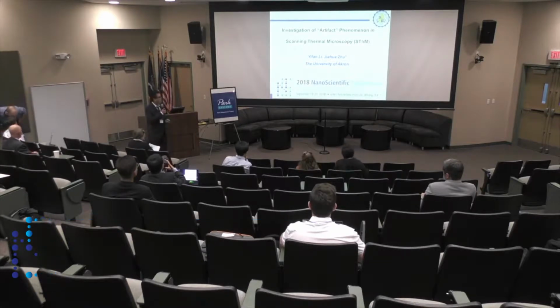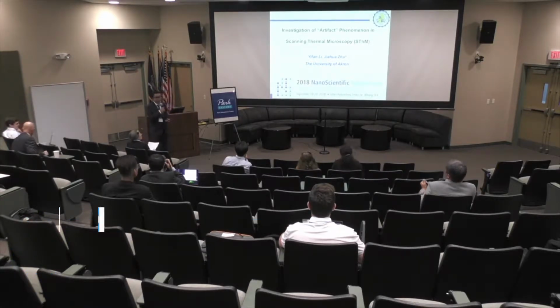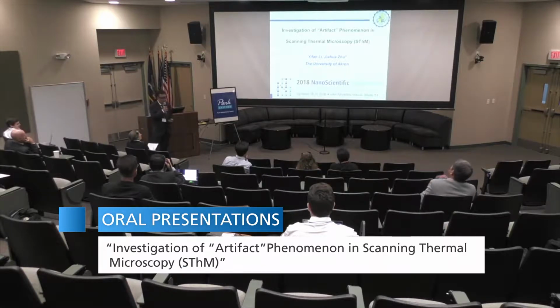So the topic of my presentation today is the investigation of the artifact phenomena in scanning thermal microscopy, SThM.